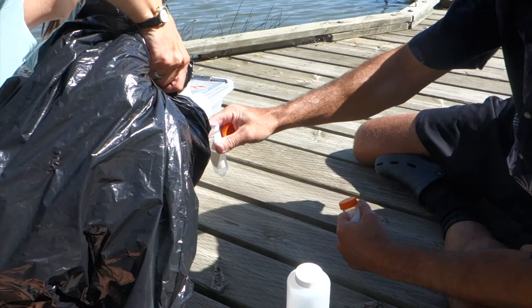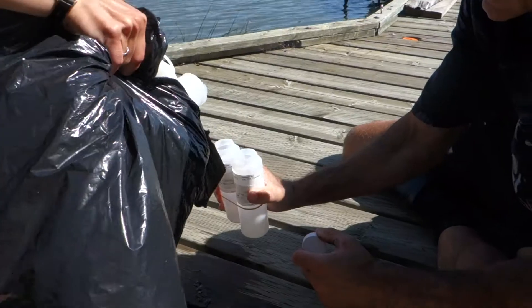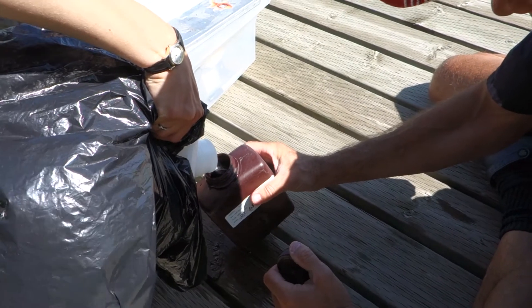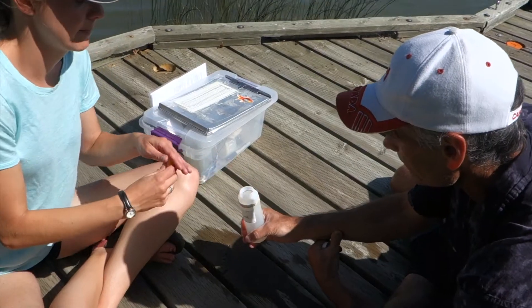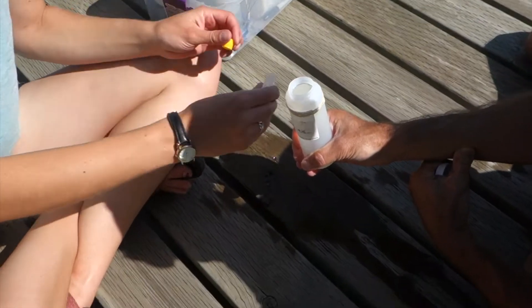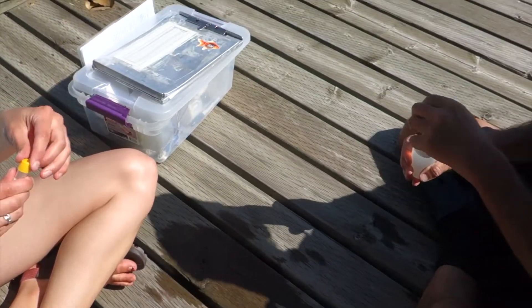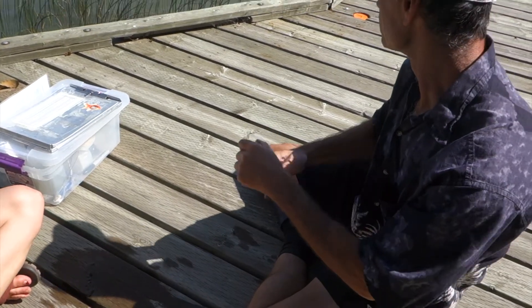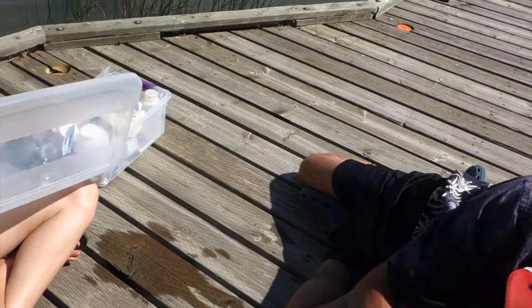These water samples are sent to various labs to look at parameters pertaining to overall lake health such as nutrient levels, ionic composition, total dissolved solids, dissolved organic carbon, and total suspended sediment. Additionally, the water will be tested for chlorophyll A, which is the green pigment in algae as a proxy of algal biomass. We also test for microcystin, which is one of the main toxins produced by cyanobacteria, also known as blue-green algae.